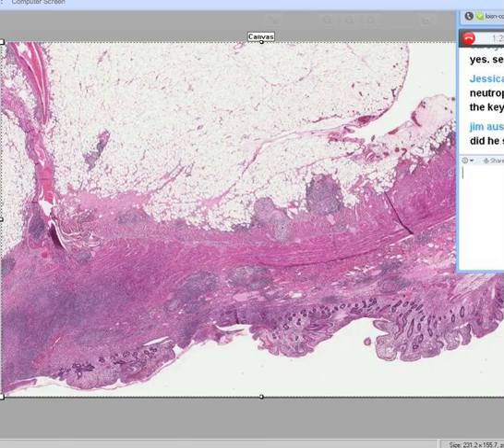Okay, in a few seconds, you're all going to see another cross-section of a gastrointestinal organ. And I would assume you probably all see it now, right? Okay, good. Tons of fat on the top. So you know that that is either the serosa or the adventitia. That's the connective tissue. You can see some big blood vessels in that mesentery as well. In addition, you can see this big band of smooth muscle. So you know that's the muscularis. In addition, you could see submucosa and mucosa.